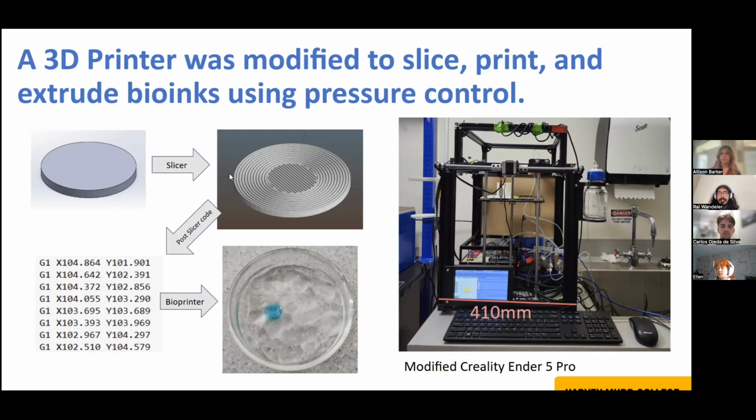This pneumatic pressure displaces bioink from a reservoir on the printhead, which is a bit difficult to see in this picture, extruding it through a nozzle into the FRESH gel. One of our team members, Carlos, will further expand on the pressure pump system.